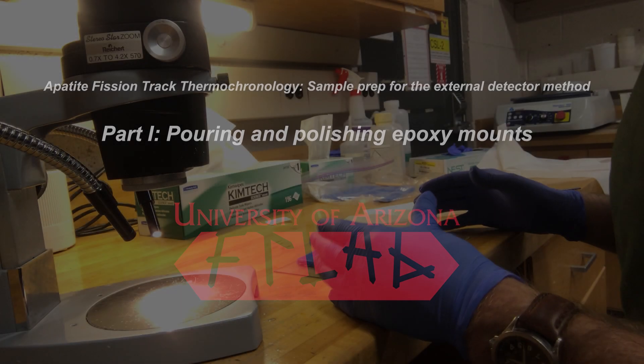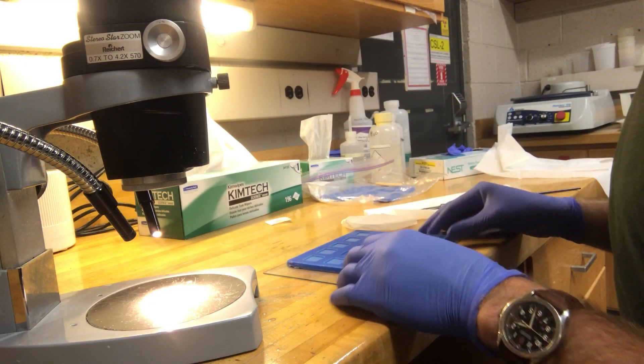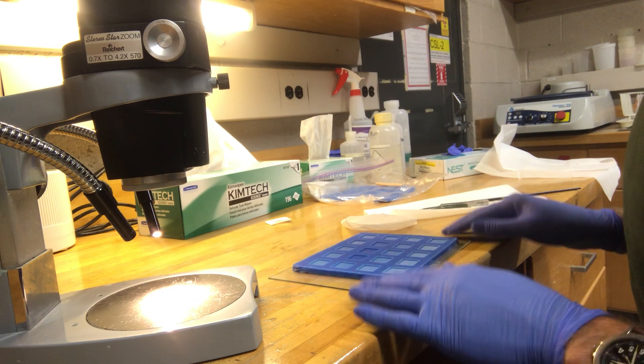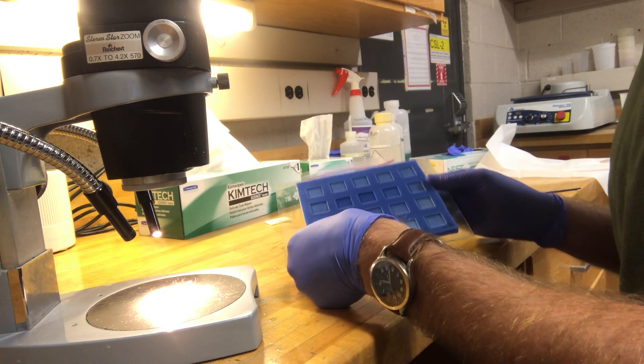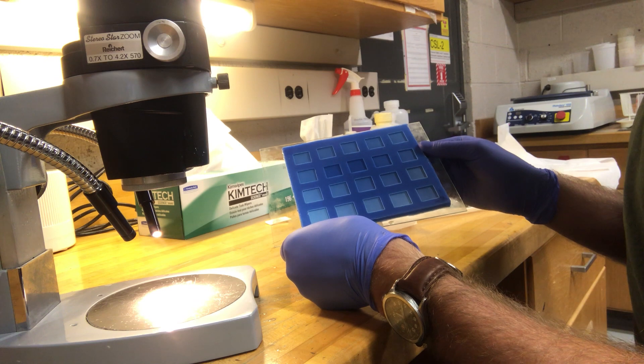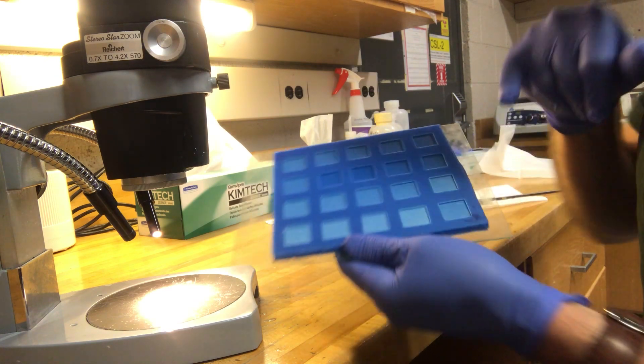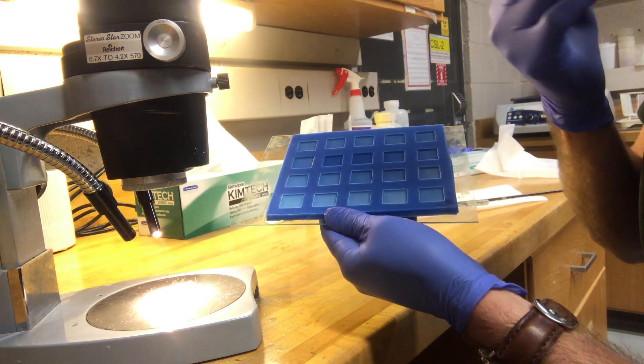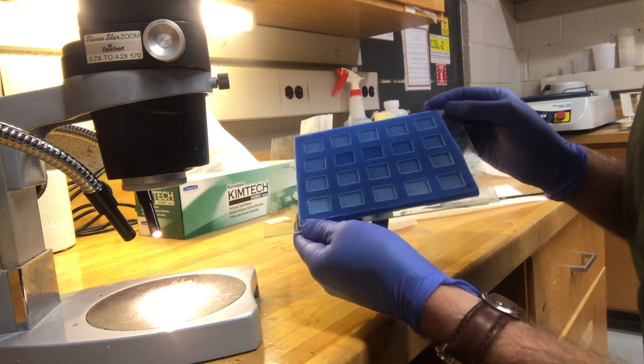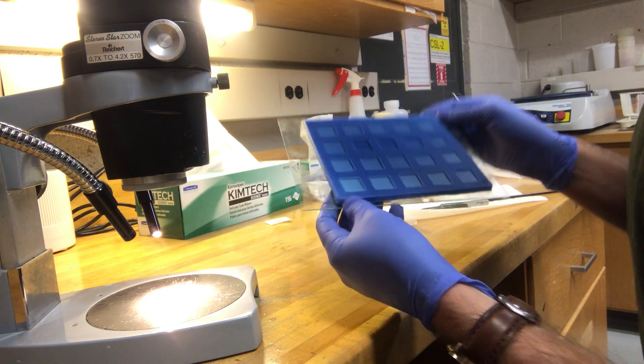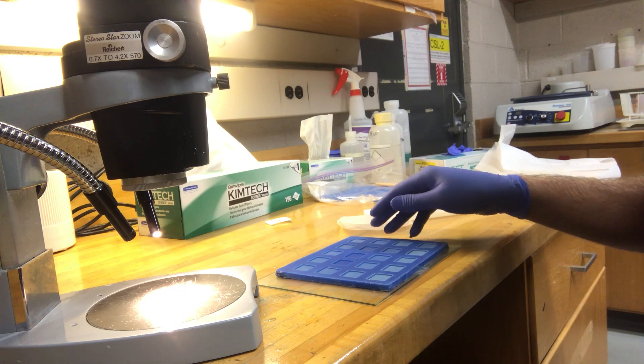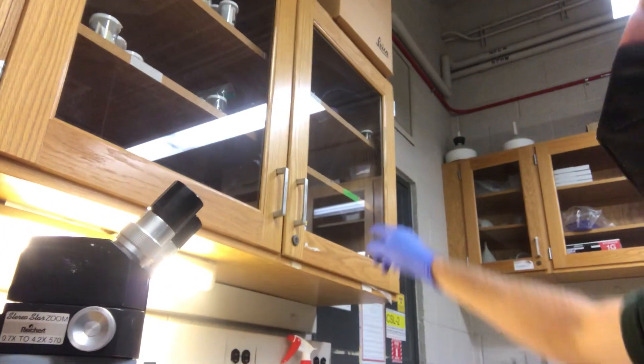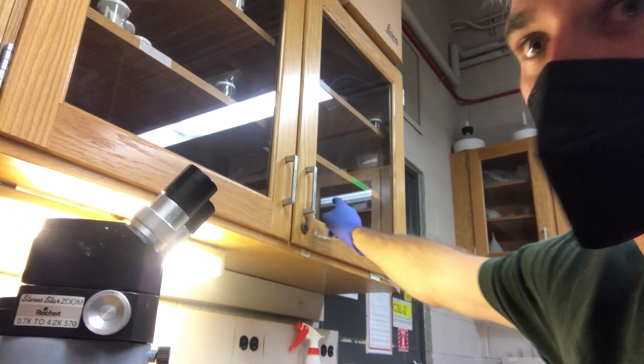Currently I'm just going to show you how to mount your apatites for EDM analysis. The first thing you do is get one of these lovely little epoxy molds made out of rubber. You'll see that some of the molds might be a little white, which means they're pretty worn out and we want to avoid them. There is epoxy and epoxy molds that live up here in this corner cabinet.